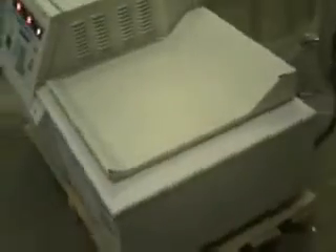While it's ramping up to speed, let's take a look at the rest of the unit from every side. It has some cosmetic scrapes. We're going to touch that up as much as we can.